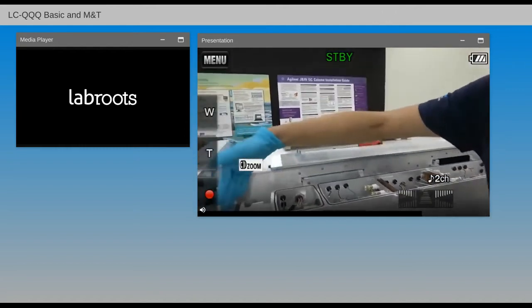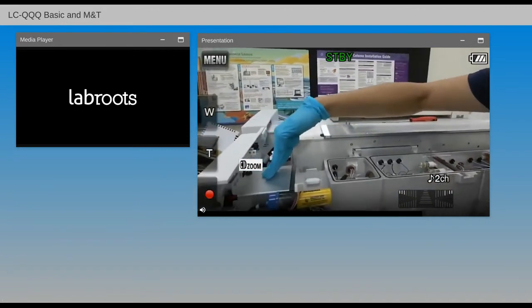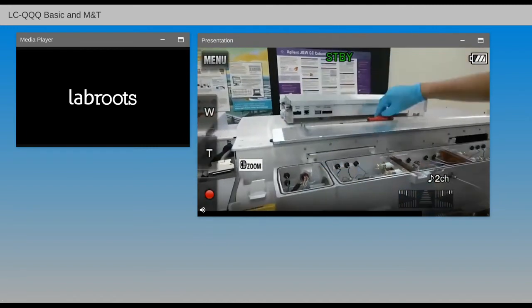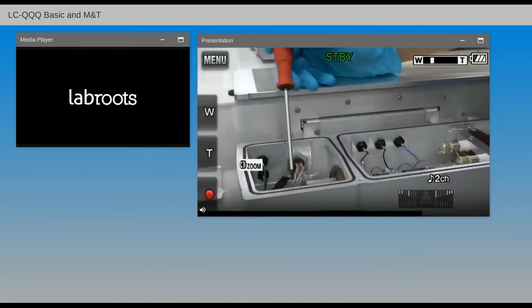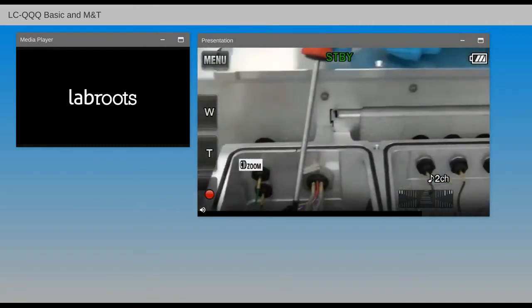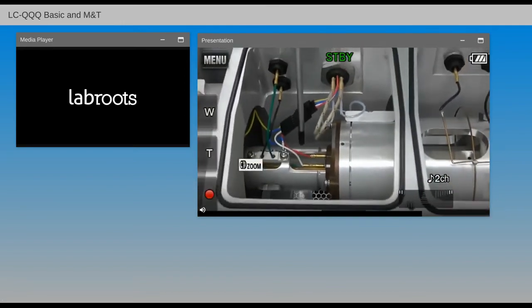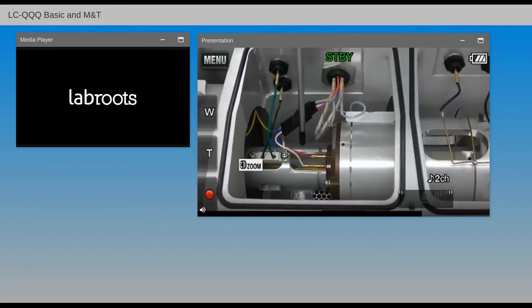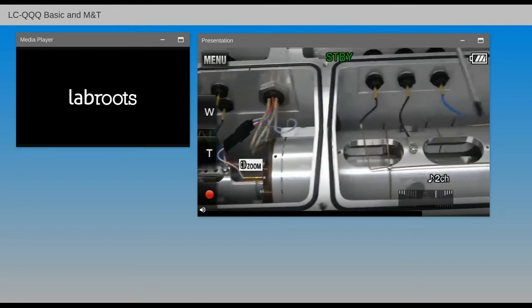As you can see, beyond the desolvation chamber, which holds the capillary, we have the ion optics within this window here. In fact, there is an octopole, eight rods, within it. Let's take a close look, as best as we can, and zoom in. So this is the ion optics, and that's where our MS1 is.